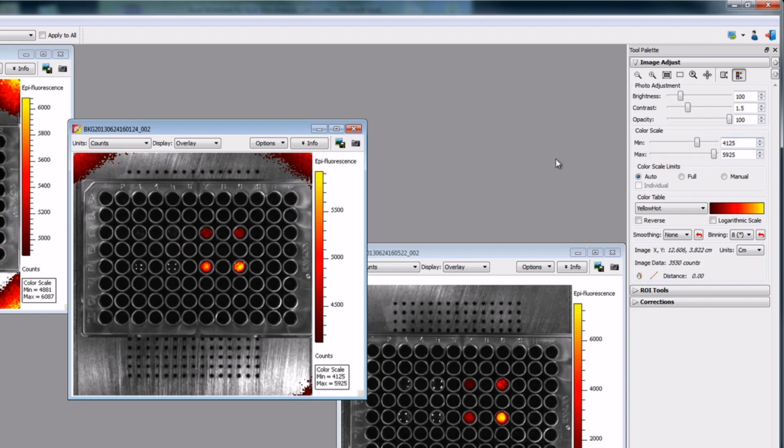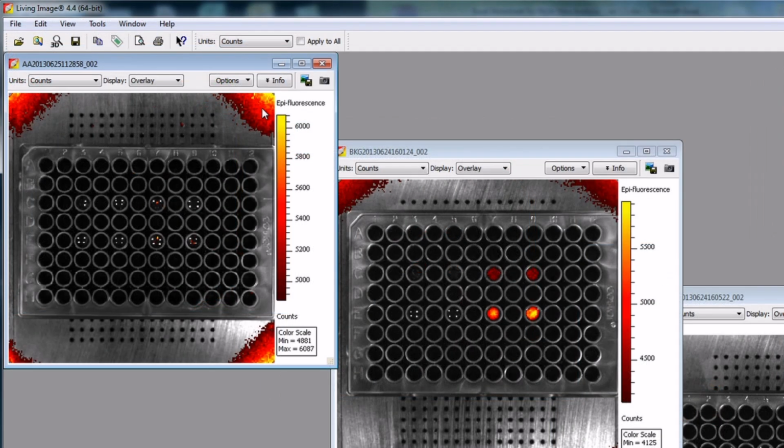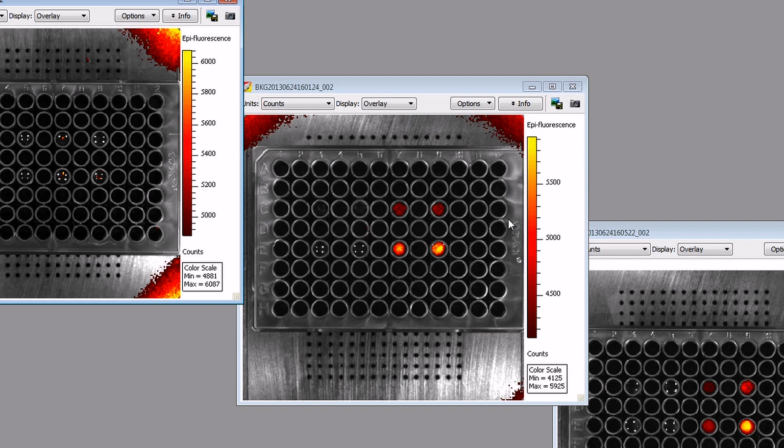With fluorescence imaging, we require an excitation light source to visualize our probes. Typically, the excitation and emission filters are very close together. Reflection off the stage may bleed through the emission bandpass filter due to the close proximity, and present as a ring on the stage, as seen here.